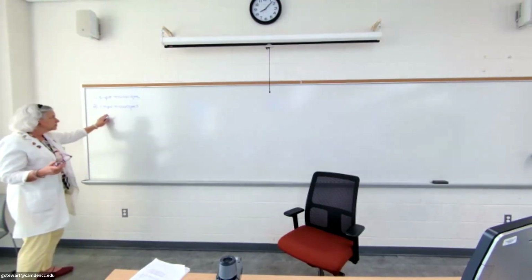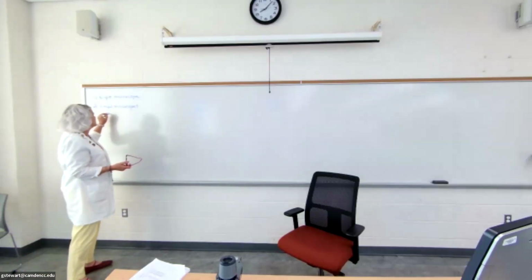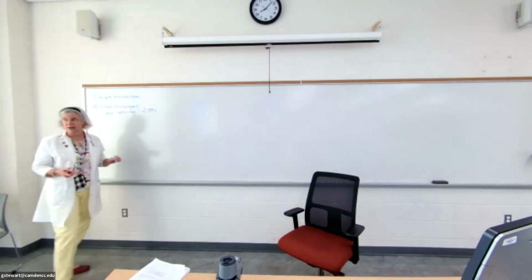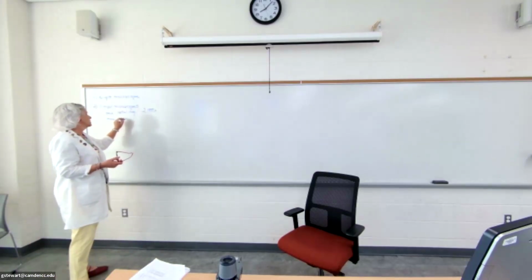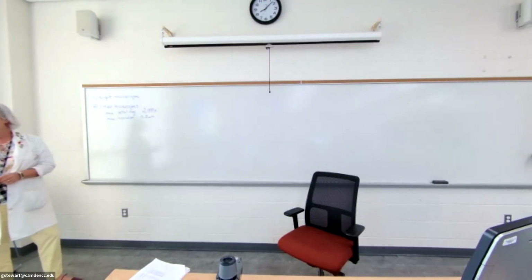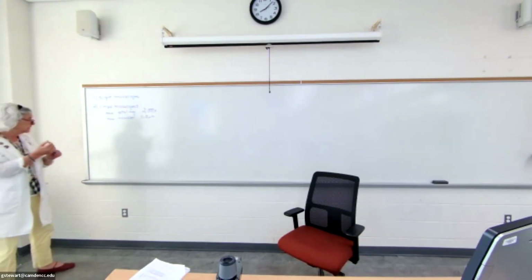So in general, for all the compound microscopes that I'm going to list, their maximum total magnification, if you have all the special lenses, is going to be about 2000 times the size of life. And the maximum resolution is going to be 0.2 micrometers. So 0.2 millionth of a meter, so 2/10 of a millionth of a meter, very, very close together.